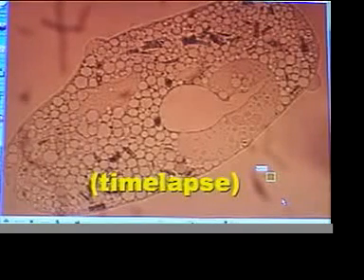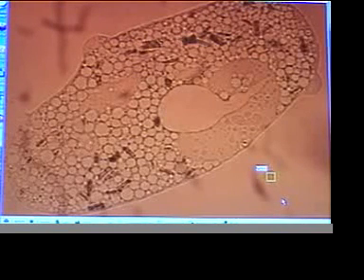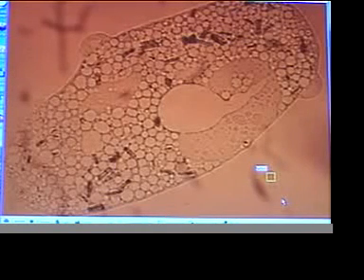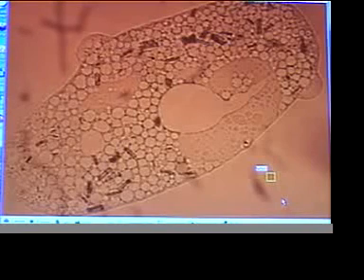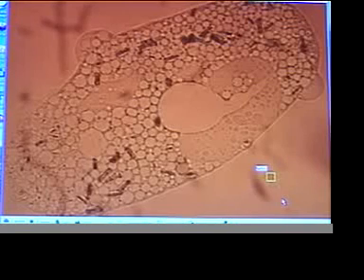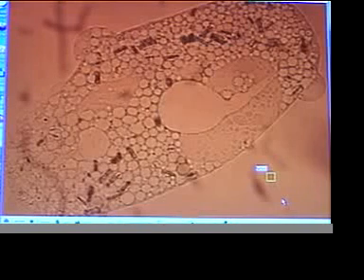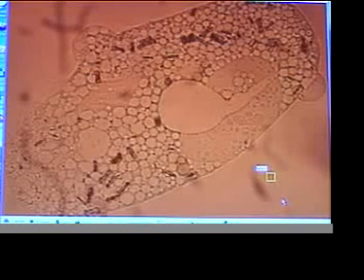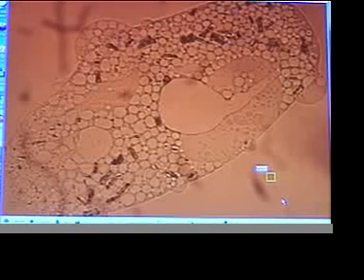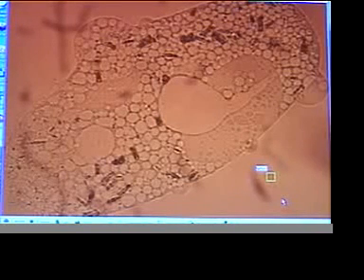Oh, now we have a bubble on the upper left. On the right, we are seeing possibly a breakthrough now in the cell wall. I would say this organism is devitalized. The primary frequency it seemed to be sensitive to was 1178 hertz, but it did undergo a sweep starting at 1175 with 5 minutes on each frequency. It's a sine wave input. Now you can see quite a bit of destruction.